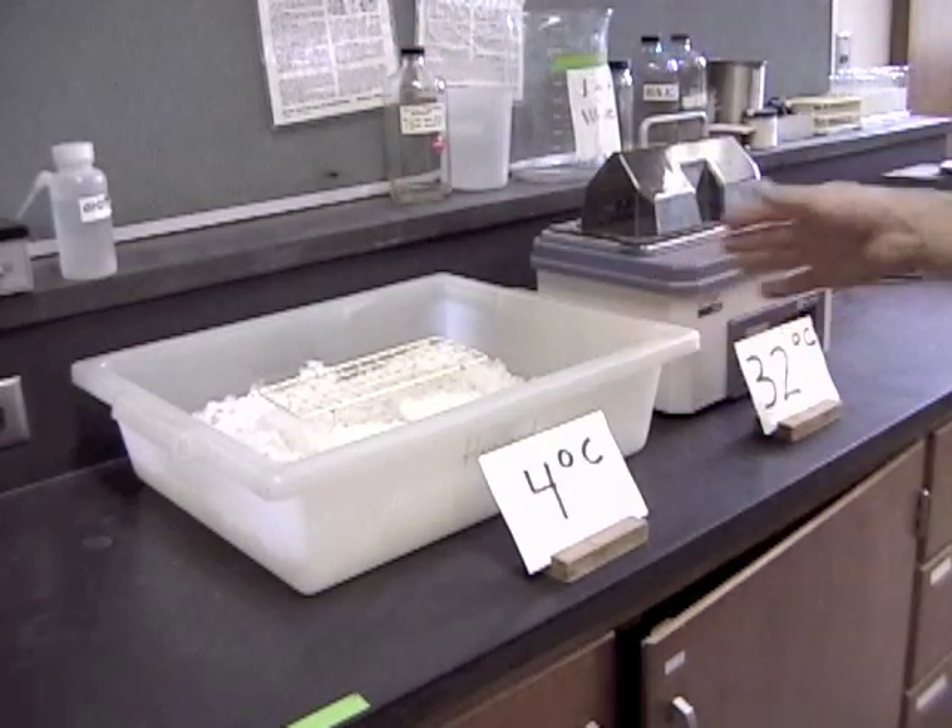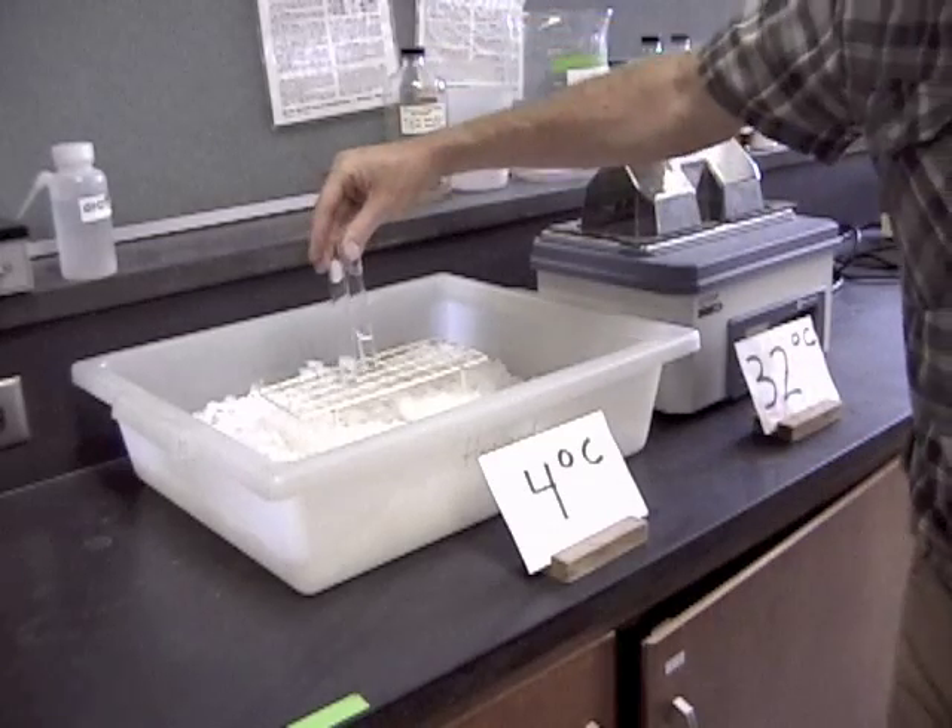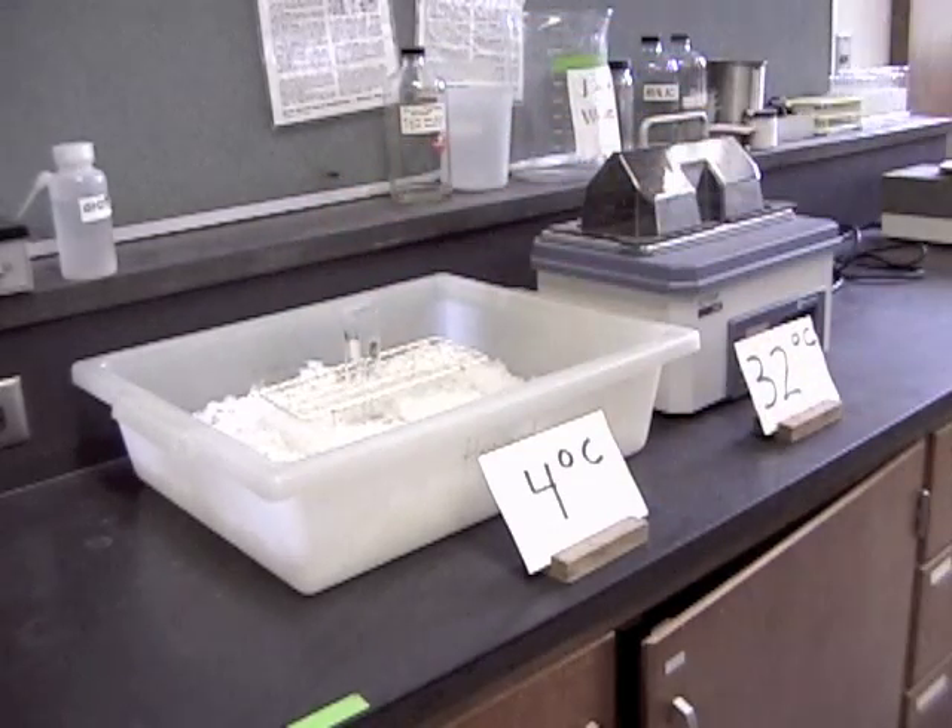In the lab there will also be ice baths and water baths to get them at the right temperature. Remember, you have to put them in there and leave them in for 10 minutes before you start the experiment.